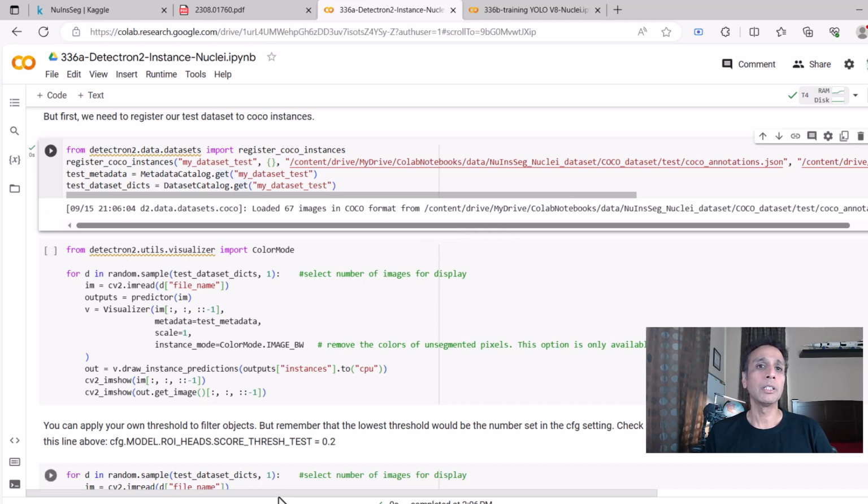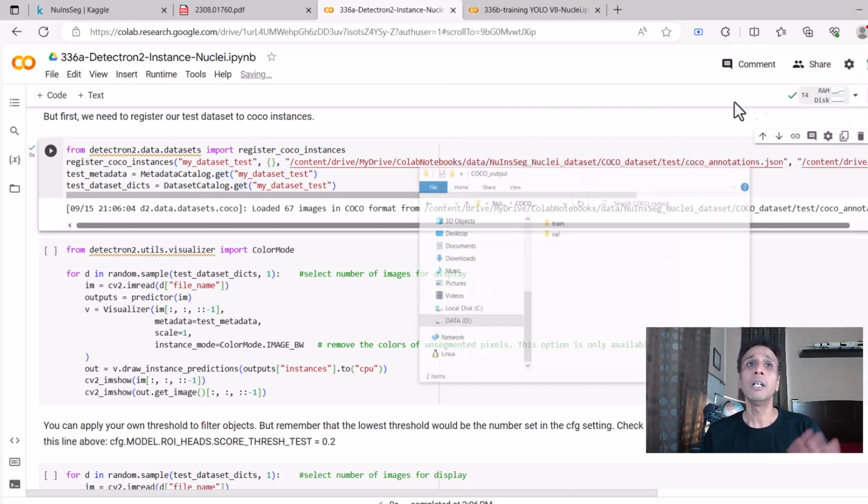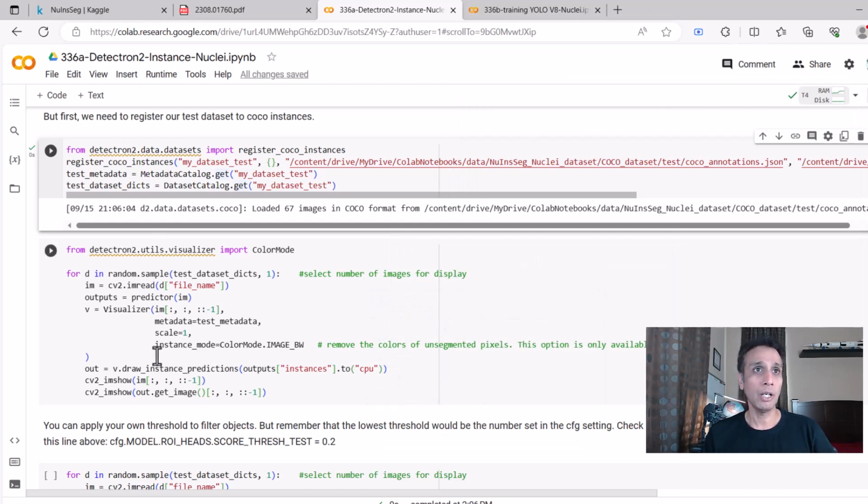And by the way, the reason you don't see the test folder right here is I did that later on a different system, and I obviously forgot to copy it to this system locally, but of course I uploaded that to the cloud.